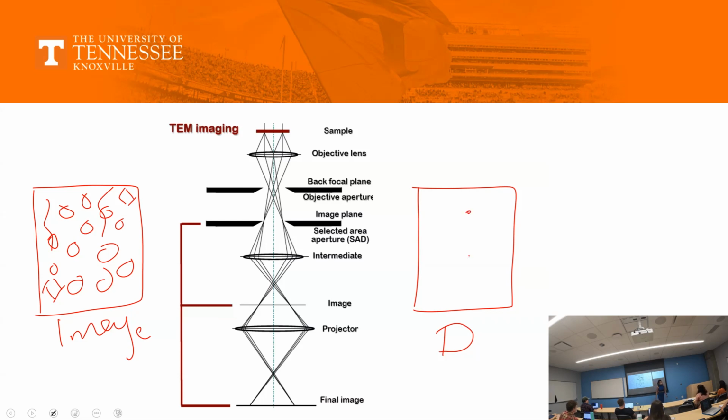You can have 4 spots which are very neatly aligned in a square way. Or another D pattern could be simply squares, like this. You can see different spots. I will come to them in the next slide, but I'm just trying to emphasize it here. This is like you can make a small square virtually in your mind. Here you can make a small hexagon in your mind, right? What does this tell you about a crystal?